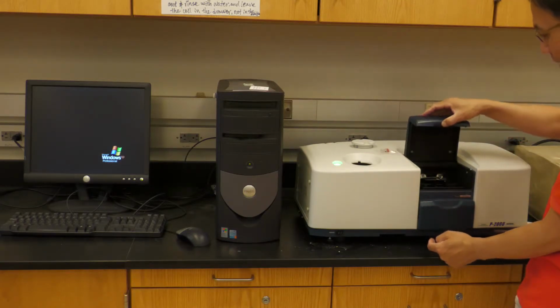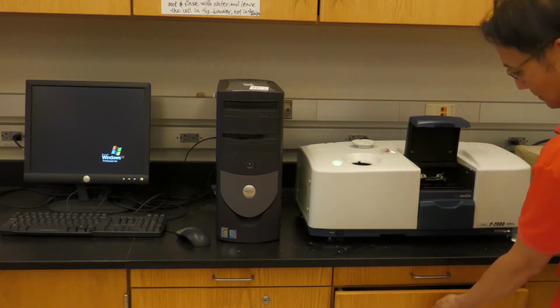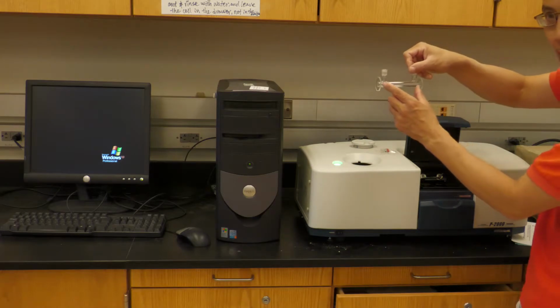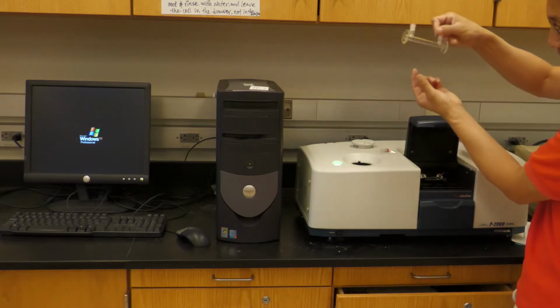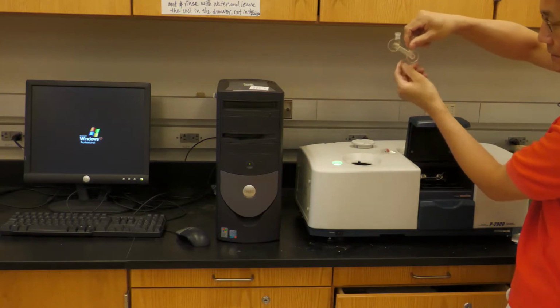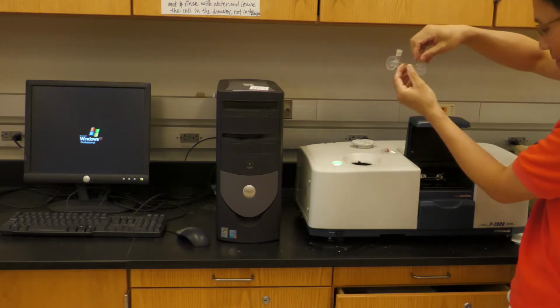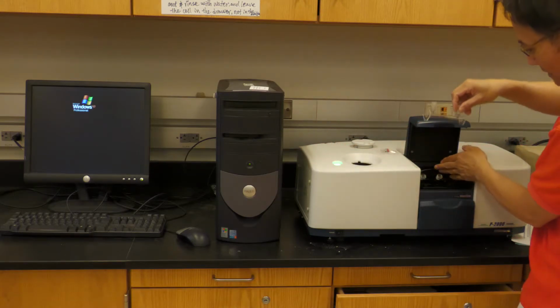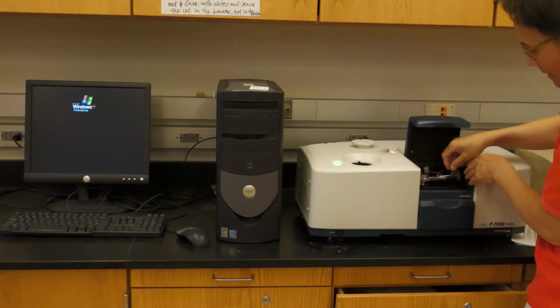Okay, so now let's go through these chemicals. Now suppose we put your chemicals here. Okay, so you can see these two ends are a little bit different. This end has a small cut. This end is just a round one. So this small cut will face the light in. Okay, so you will put this one here.